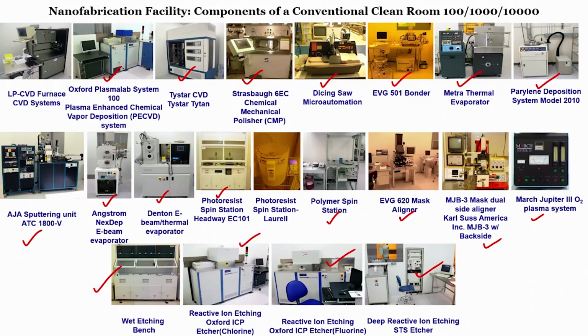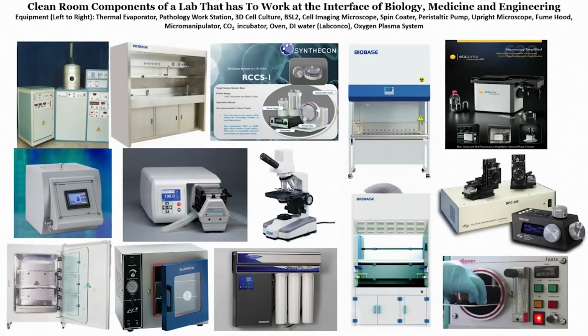But what we also see is a clean room where the biology experiments have to be performed. In such a clean room, you can design the device, you can fabricate the device, and you can perform experiments, right. Such facilities are available in a few of the top class universities across the world, and we are trying to replicate a small facility over here as well.